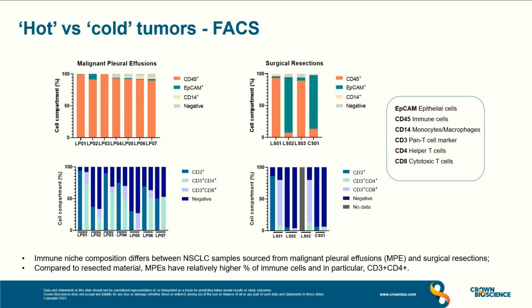Identifying such differences from one indication to the other and from patient to patient within the same indication is not only important for the predictive value of the human TME analysis, but also for selection of the right contexture for testing novel therapies.